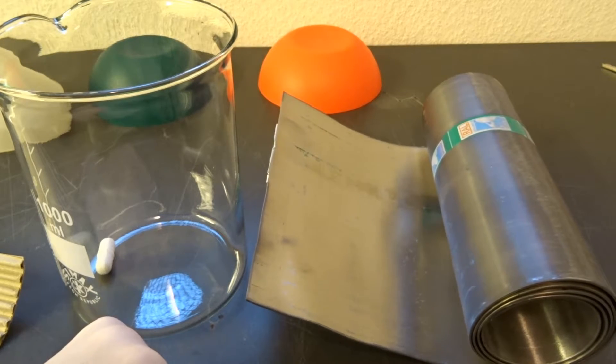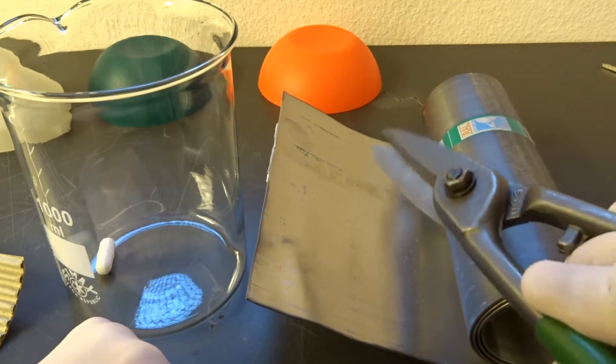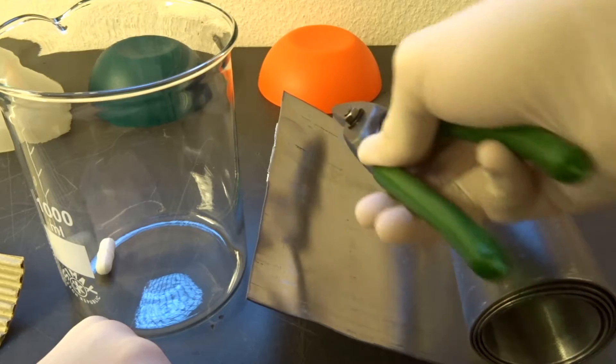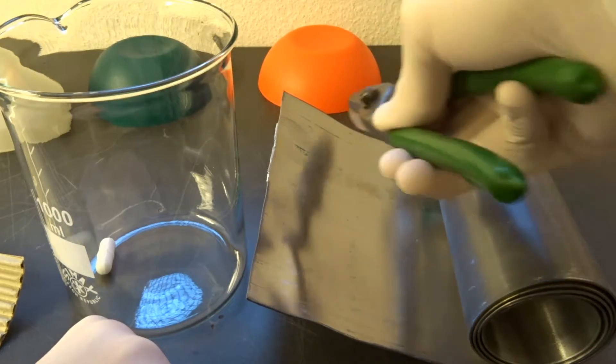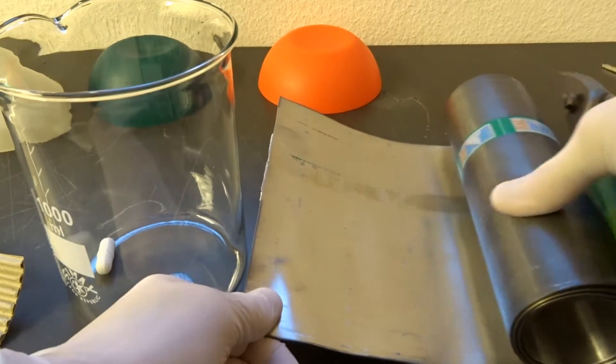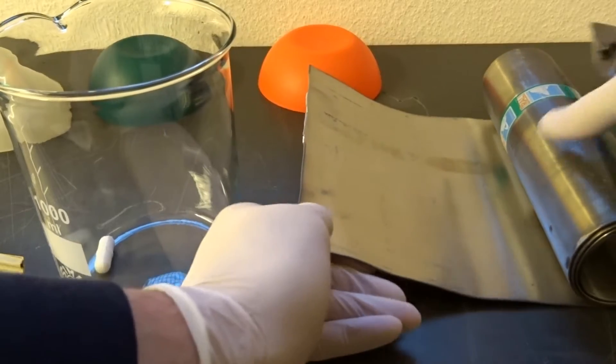I just need to cut strips using tin snips in the right size to fit into the beaker and be good electrodes. So that's what I'm going to do now.